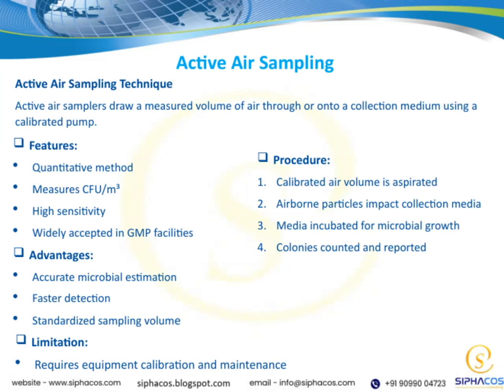One key point to keep in mind is that it requires equipment calibration and ongoing maintenance to ensure accurate results. This means that the devices need to be properly set up and regularly checked to stay reliable.